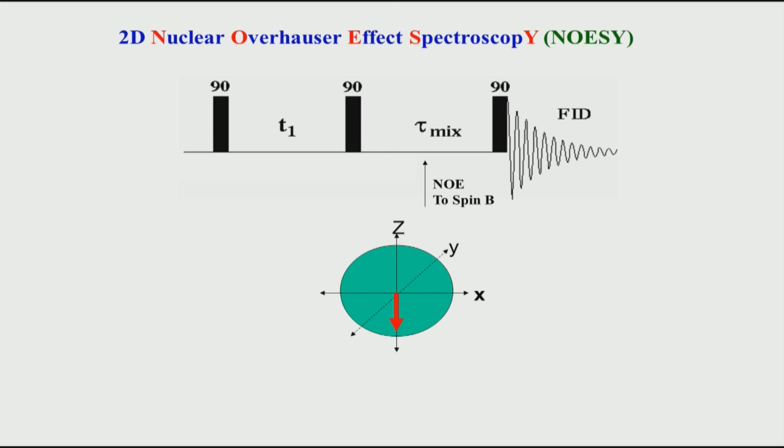But that is not the only way to do NOESY. The typical way, if you want to do a 2-dimensional NOESY experiment, we use what is called transient NOE. That means you are actually inverting the signal of a molecule. That polarization inversion, remember this is inversion, means we have inverted the population kind of. We have inverted the polarization, and that is transferred to a neighboring hydrogen if it is proximally located. That is how this is done, and that is called transient NOE.